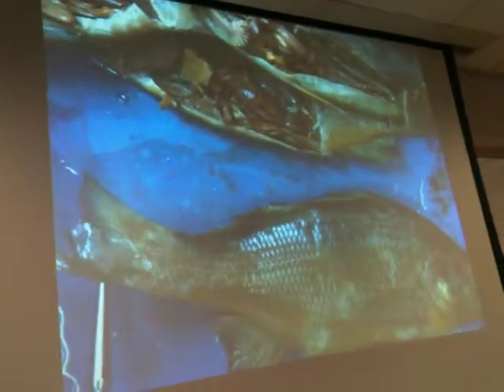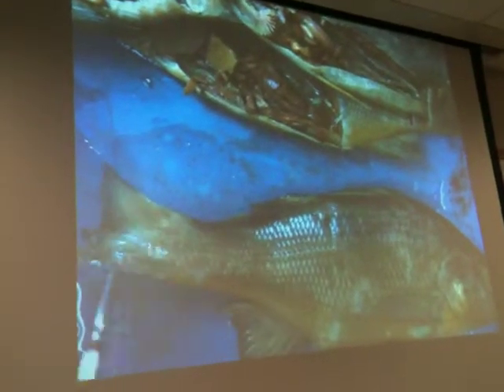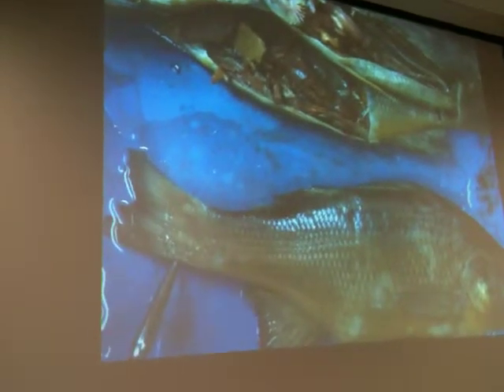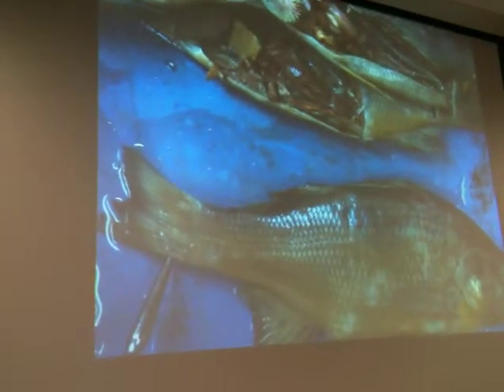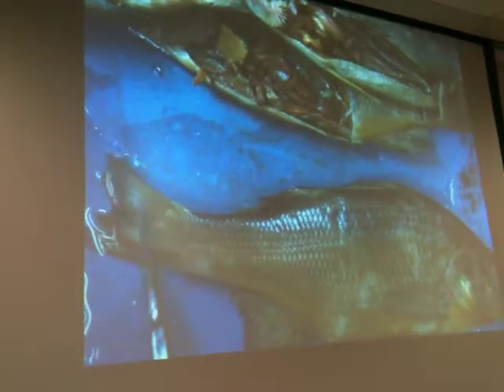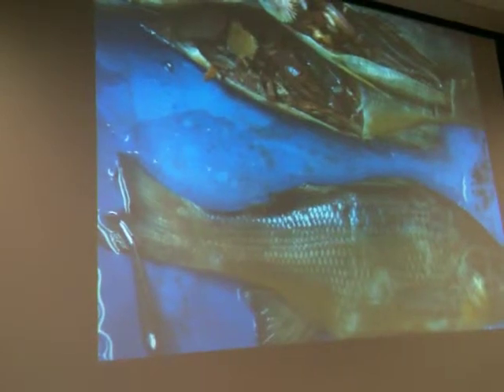And you have to know that it has a homocercal tail. Heterocercal? It says heterocercal in your lab, right? No, it says homocercal. It says homo, okay. Oh, trying to trick me. It's homocercal. Okay. That means that the dorsal and ventral sides are roughly about the same size.